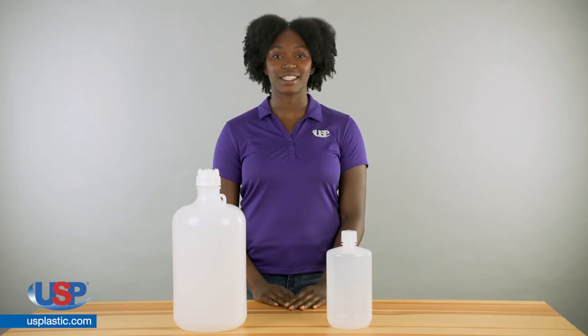U.S. Plastic Corp. offers an extensive collection of Diamond Rio Seal bottles. Diamond Rio Seal bottles are lighter in weight than glass and protect against leakage, breakage, and contamination.